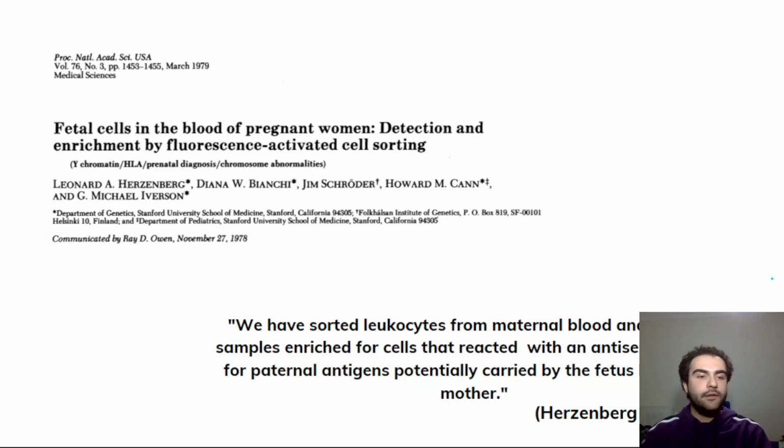Also, another article that I found interesting: using the Fluorescence Activated Cell Sorter, which is FACS, they have sorted leukocytes from maternal blood and obtained samples enriched for cells that reacted with an antiserum specific for paternal antigens potentially carried by the fetus, but not the mother.